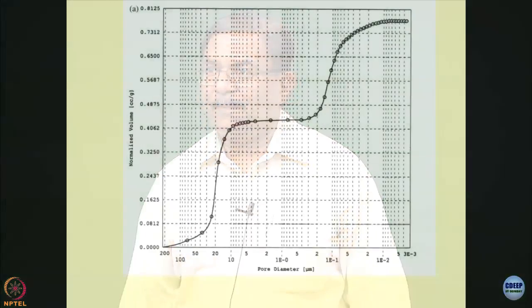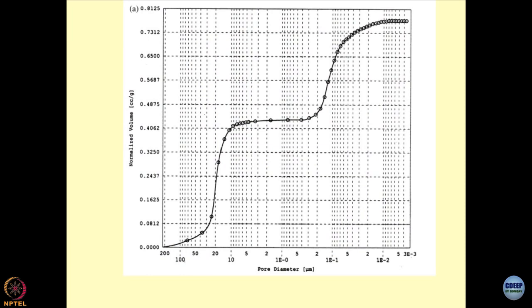Is this okay? These types of analysis, as I said, are being used by the people who are into the industrial processes of minerals, ores, different types of metals, tissues. We get a lot of samples in our laboratory from biosciences, where they would like to analyze the tissues, thin films which are being made by physicists for various purposes, different types of surfaces which you want to create for adsorption to occur or for coatings and so on.